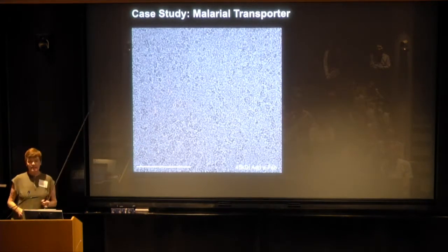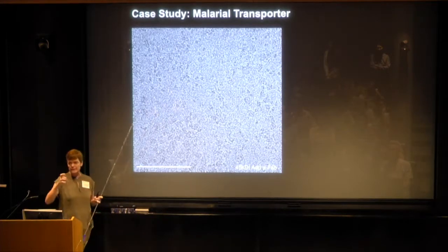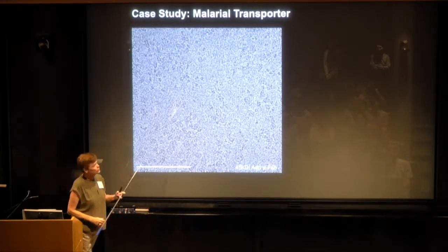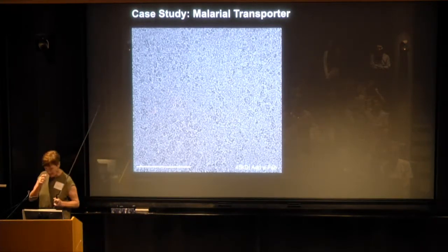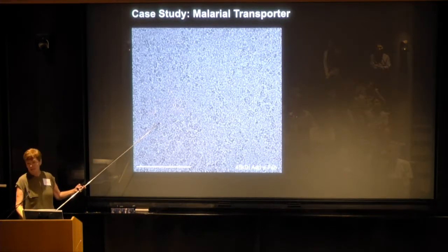This is a tiny, tiny protein. It's 45 kilodaltons. It's almost invisible. It's in a nanodisk. So the nanodisk actually weighs more than the protein. So if you solve this without a little Fab attached, you've solved nanodisks really well to high resolution, but not so much a protein. So it's hard to see, hard to pick these particles again.